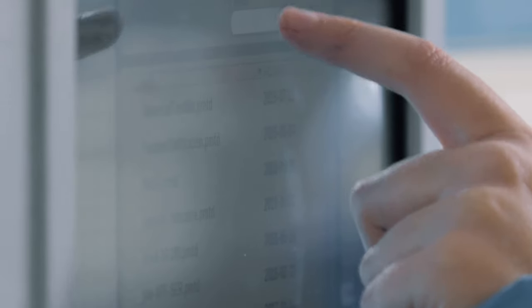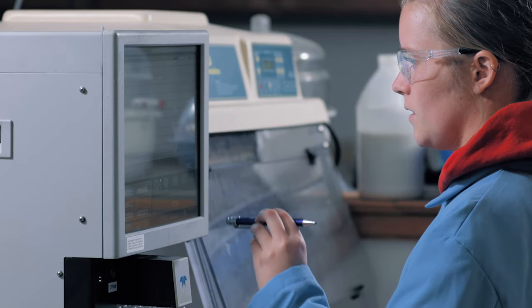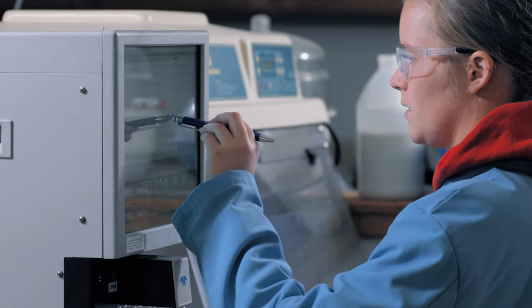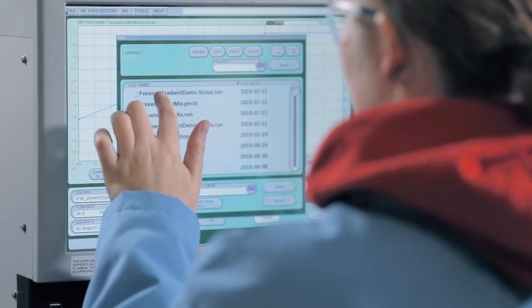The Focused Gradient Generator, part of the Acuprep software update, will save you time and money while it improves your separations. As part of column installation, program the initial scouting gradient.